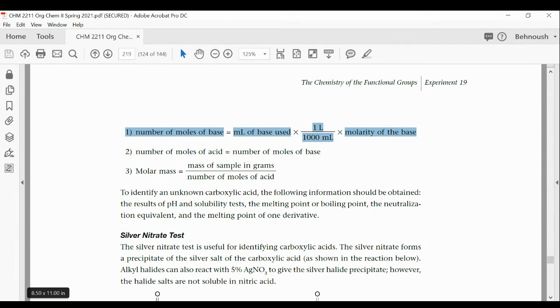When you do a titration, when you add enough base to neutralize all the acid, as soon as the solution becomes basic, it turns pink. So it's not positive or negative. That's where you count how many milliliters of base you have used. It is a titration experiment. It is not qualitative analysis. It's a titration.